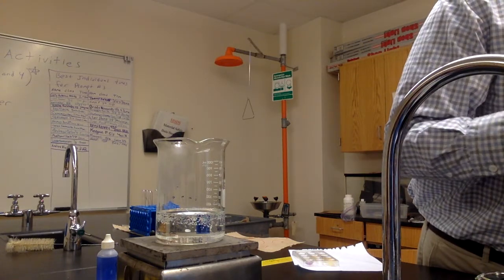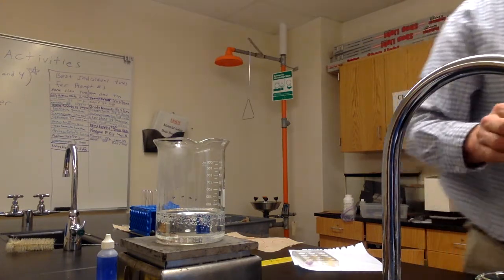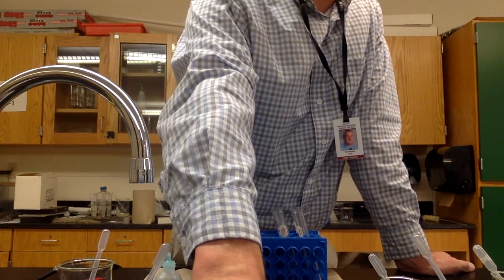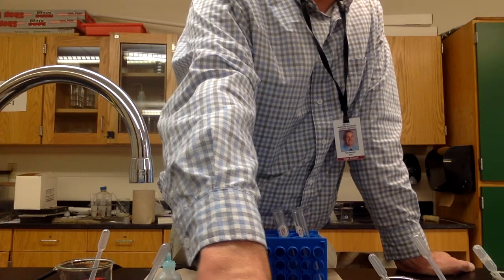All right, so that's how to test for sugars. Use Benedict's, 1 dropper full of the unknown, 5 drops of Benedict's, put it in water for 5 to 10 minutes. Positive test is red, yellow, orange, green, or brick red.